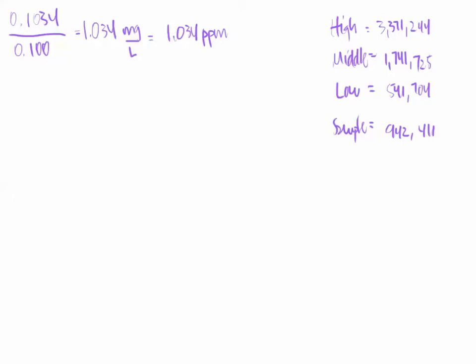Previously in math class, at least that's what it felt like, right? I mean, we were talking about these calculations and these graphs and these lines and numbers and areas, and oh, who said math was going to be involved? Okay, well, not a lot of math is involved, honestly.